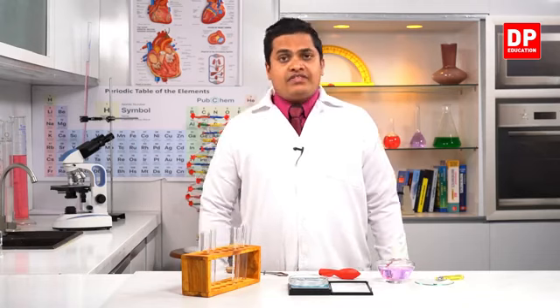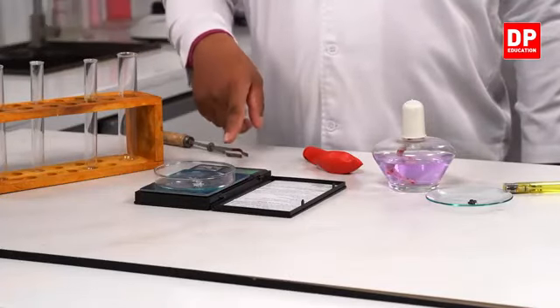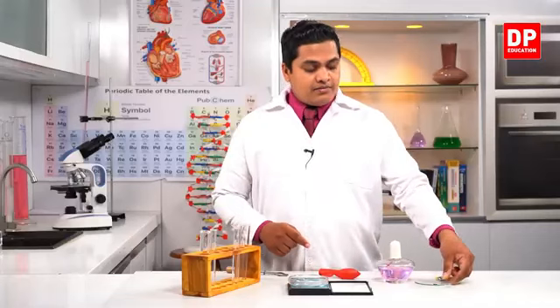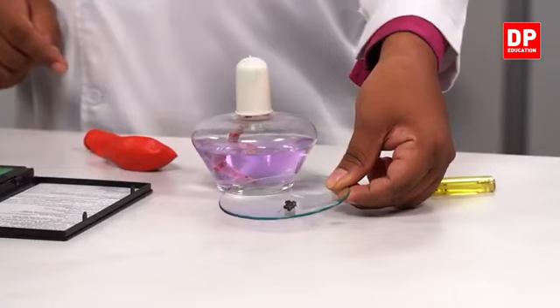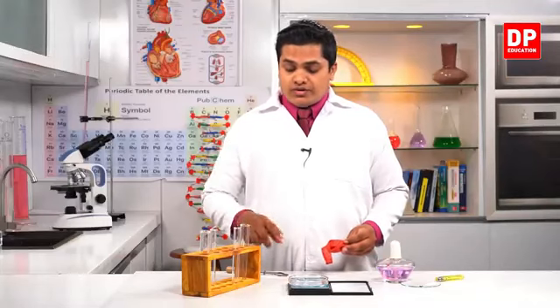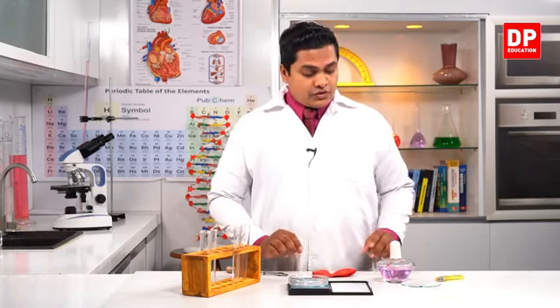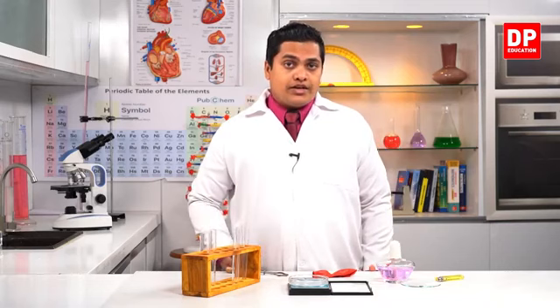So once again, I have these materials: a boiling tube, a digital balance like in the previous cases, a spirit lamp, and some matchsticks. Once again, I have used the heads of them, right? And a balloon to enclose the top of the boiling tube. So these are the materials that I have, and I'm going to conduct the experiment right now.